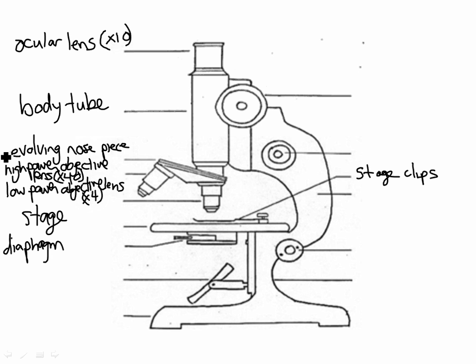What's the next one down? What do we got there? Yeah, what do you got there, Grace? Yeah, the light source. Now, the light source on ours are mirrors, and they're terrible, right? You need to be close to the window. It's no good. So we've done different things for light sources.